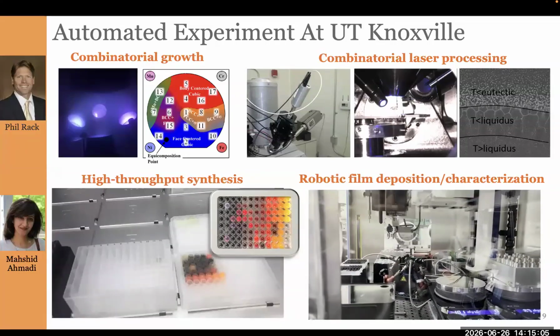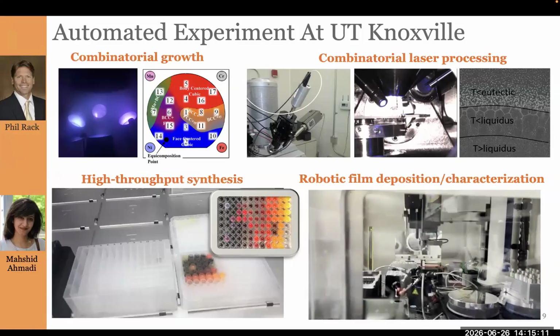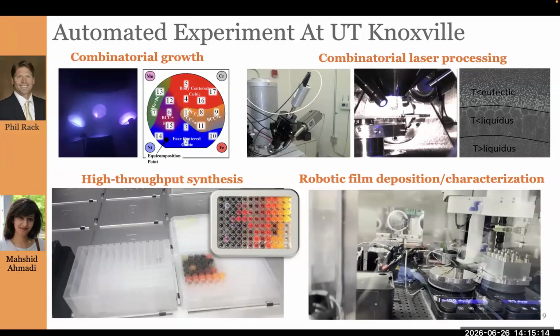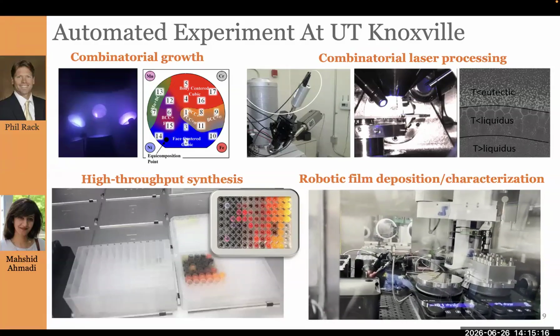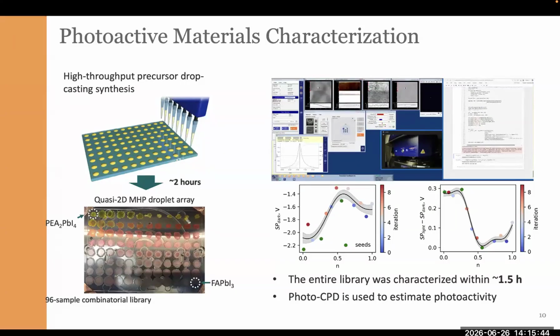There can be other ways for high throughput synthesis, such as robotic synthesis or micropipetting, etc. So if we speak not about scanning transmission electron microscopy, but about methods where we do not have such strict requirements for sample preparation and measurement conditions, for example scanning probe microscopy, such high throughput synthesis can be naturally integrated into the workflow.